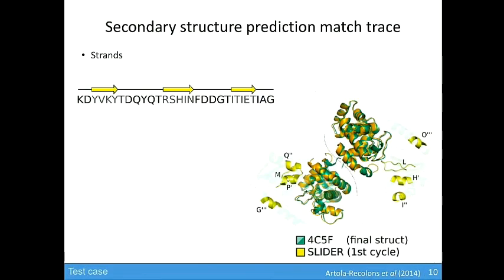So we applied such an approach on LMTC, and we applied it first on the strands because a smaller number of possibilities was allowed.